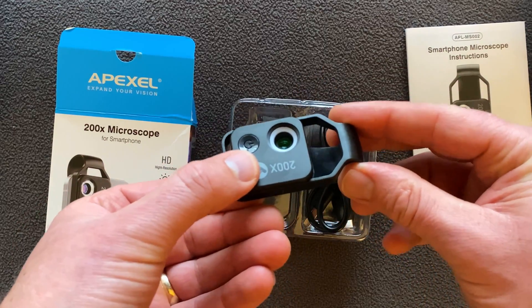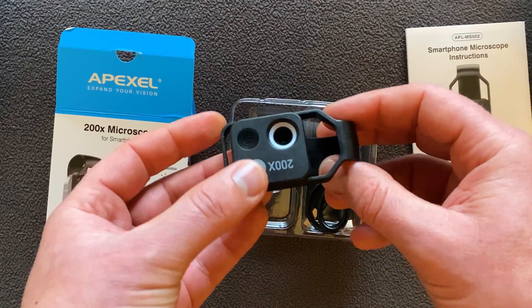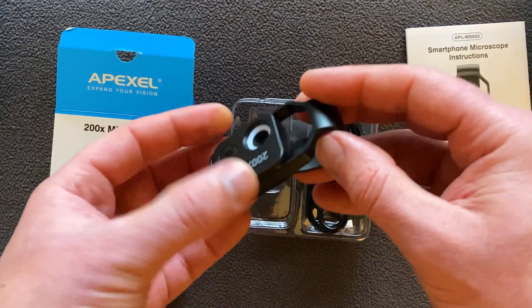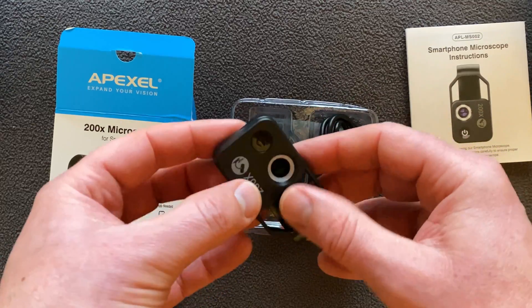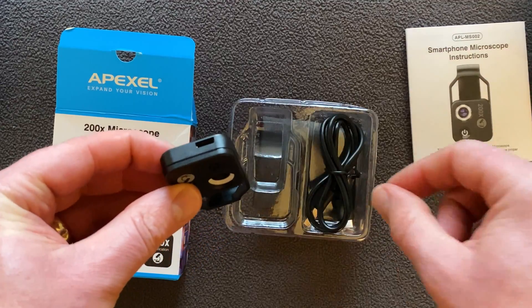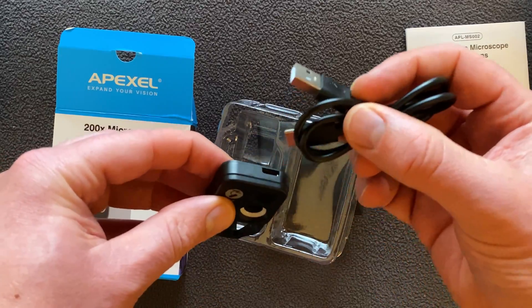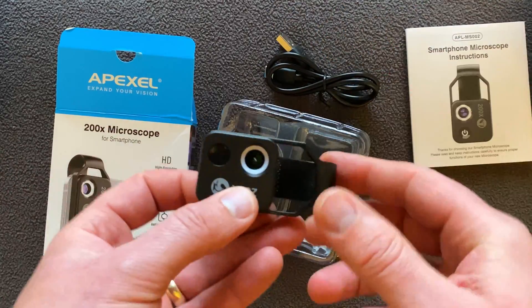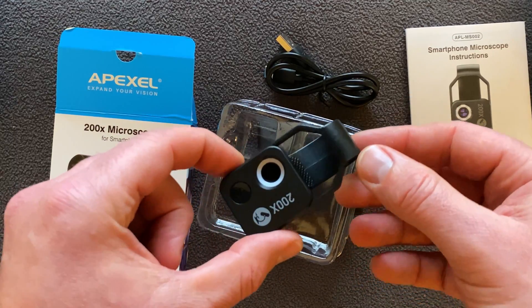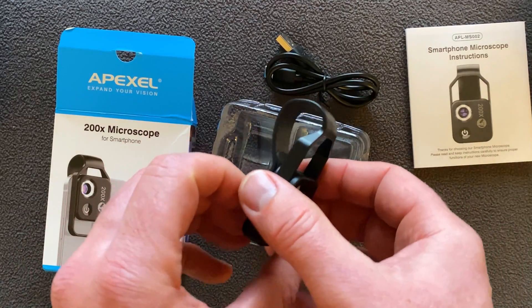The body slides up and down so you can line it up with your phone's main camera. Your phone just slides over the body, same as before, and you move it up and down for perfect alignment. To charge it, you slide it all the way to the end to reveal the charging inlet, and there's a USB charging head that clicks in. The indicator turns red when charging and goes green once fully charged. 200 times is really, really powerful — I can't wait to get using this thing.